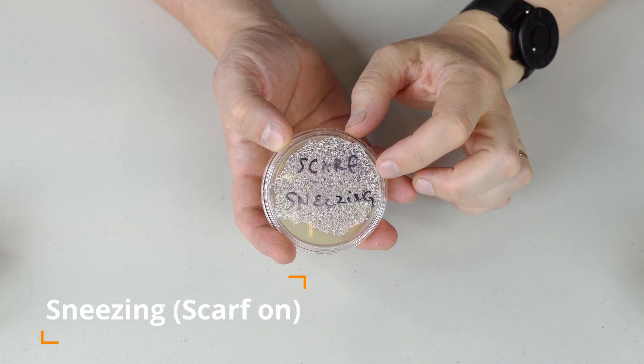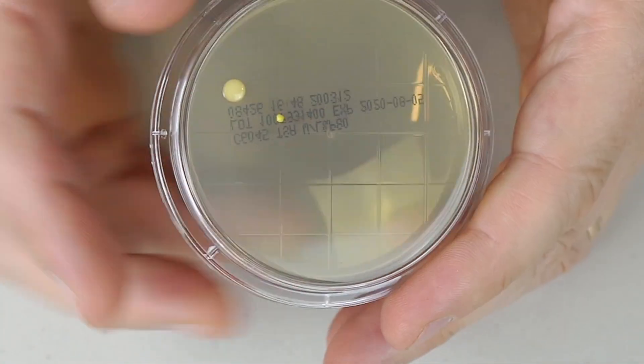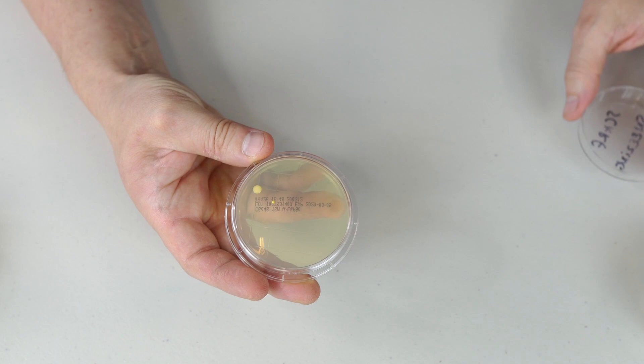I'm very interested to see the sneezing one with the scarf on. Oh, look at this one — a big one right here, and there is a small one right here as well. And this colony is huge. Very interesting results.